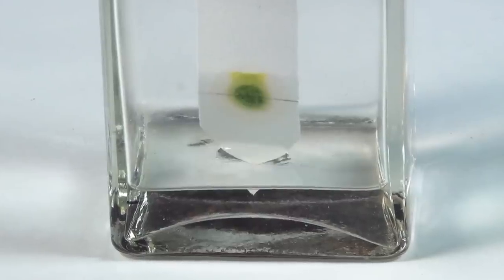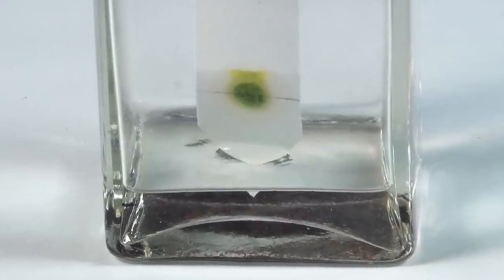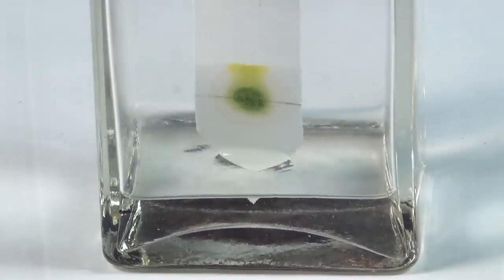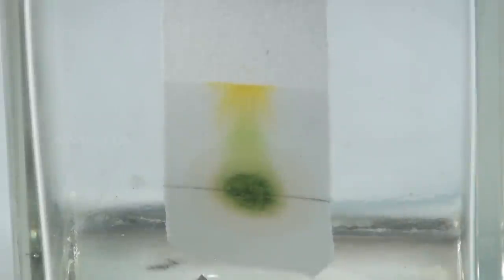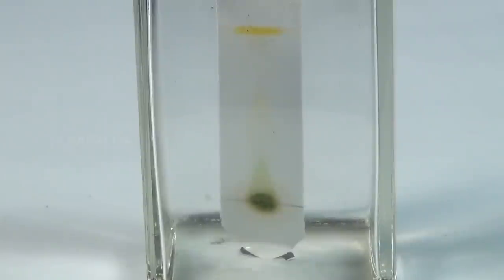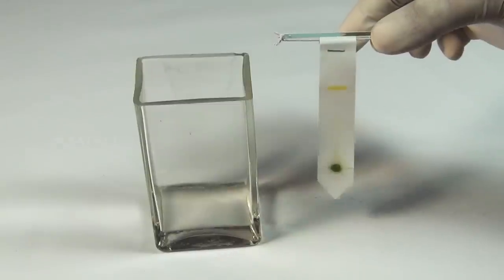Leave the chromatographic chamber undisturbed for some time. We can observe, as the solvent moves through the paper, it spreads the different pigments of the mixture in various distances. When the solvent rises above three-fourths of the way up the strip, remove the strip carefully and let it dry.